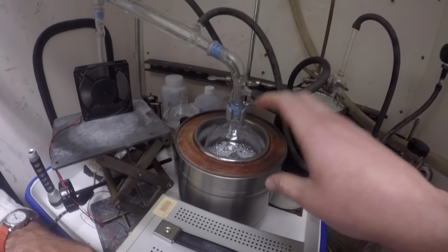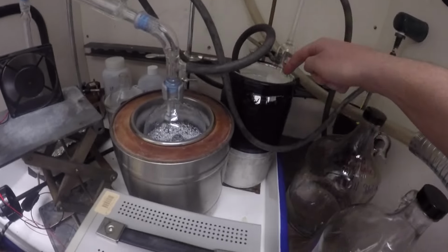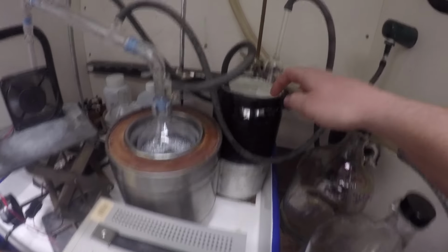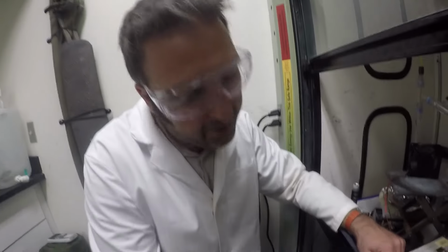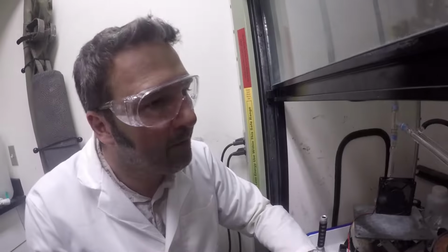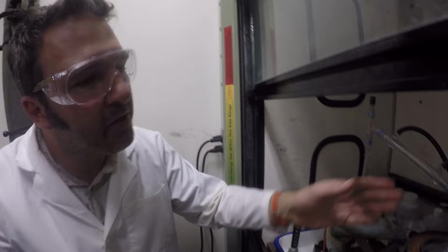The mercury vapor is what is dangerous. Right? And so we're just making sure that none of it gets out. It's really cold in here, so it's trapped here, trapped again, and then it goes through the filter down here, right? Yep. Two of them? Yeah, one filter on the input into the pump, because we don't want any mercury getting into the pump. Then on the output line, just in case some mercury manages to make it through, there's a filter there. Then up through this tube that goes up to the filtration on the hood, which is designed for chemistry to filter stuff like this out. They can handle it. Most guys don't even do it.